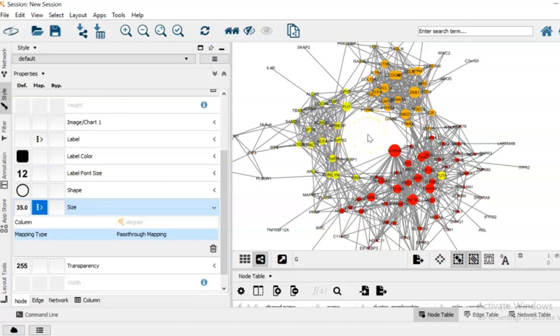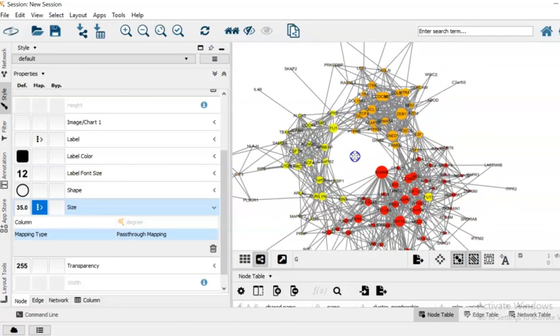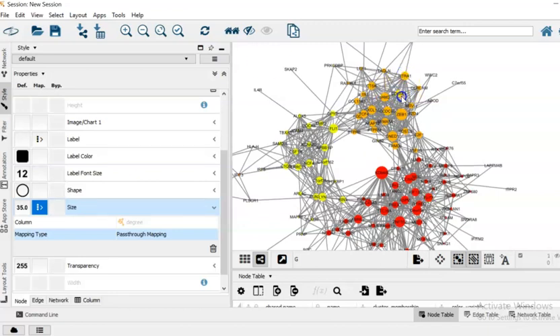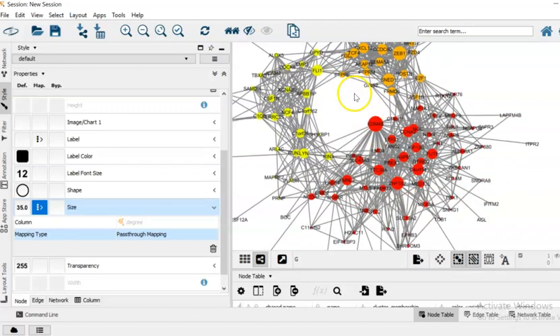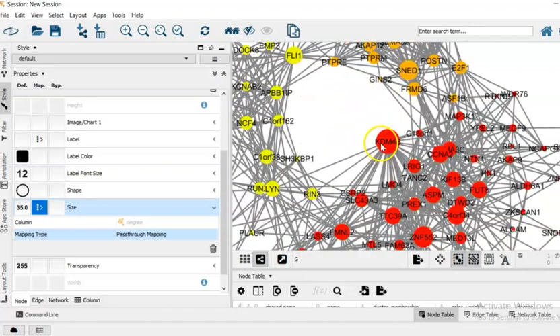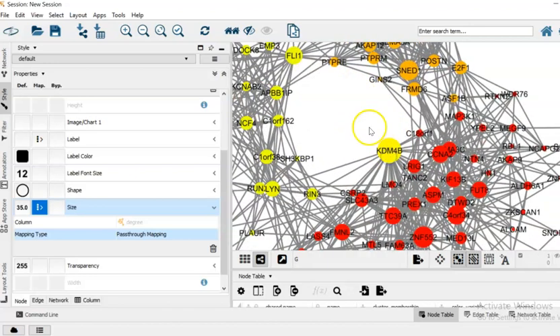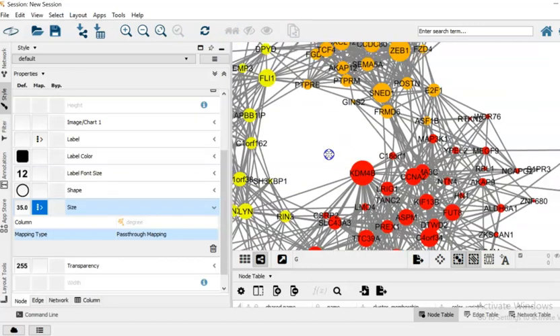Another thing that we can see from this graph is what are the hub genes in each of our communities. So for the red module or cluster, this gene kdm4b is our node or hub gene, hub node gene.